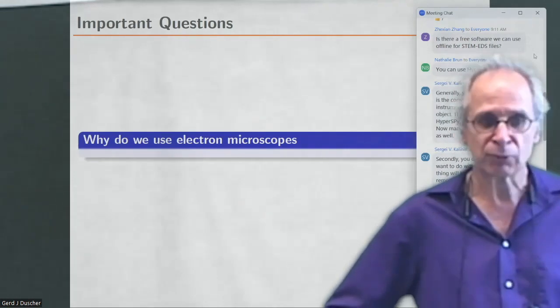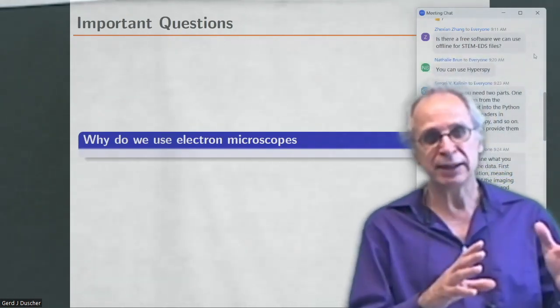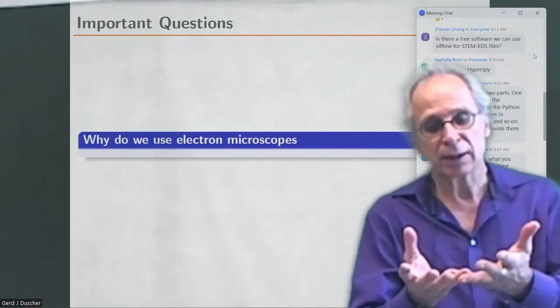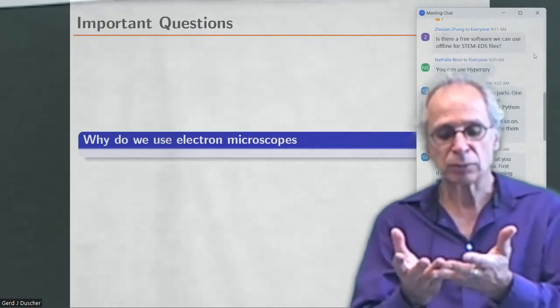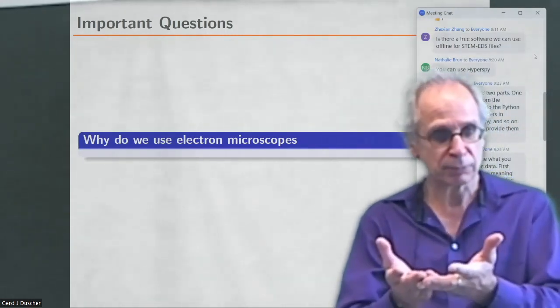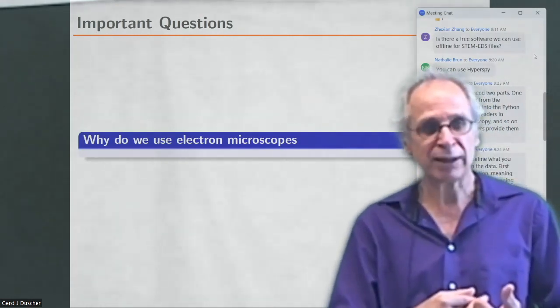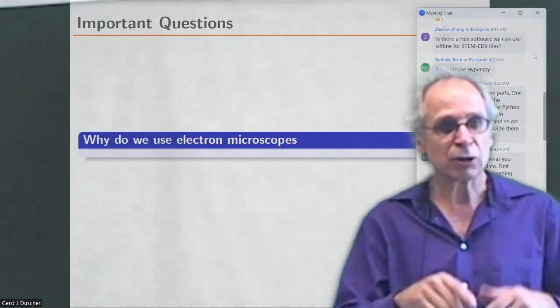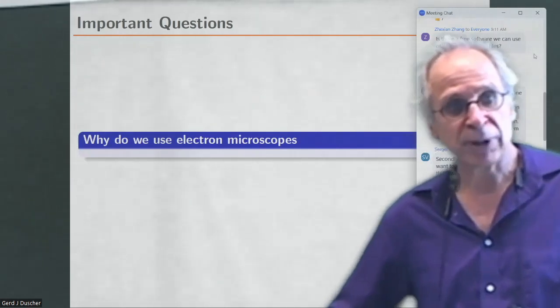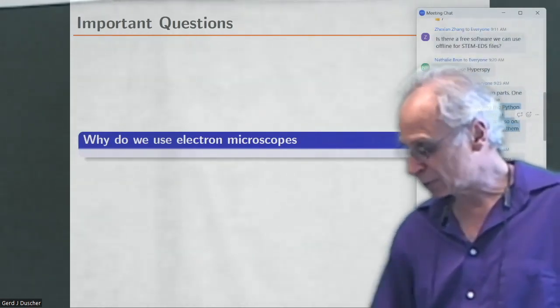There is an interesting, in my opinion, interesting development going on a few years back. Pete Nellist, he combines EELS and EDS. EELS is the primary mechanism for the signal, and then you have a yield from that with the X-rays. So lots of things are going on there, and I hope we get a lot of progress there in the next part.